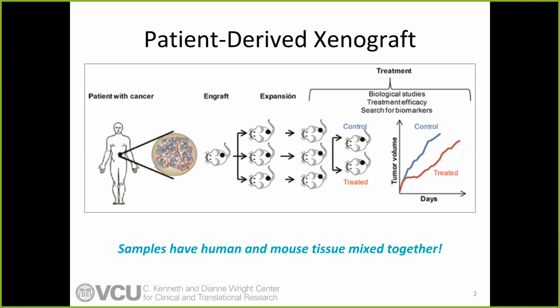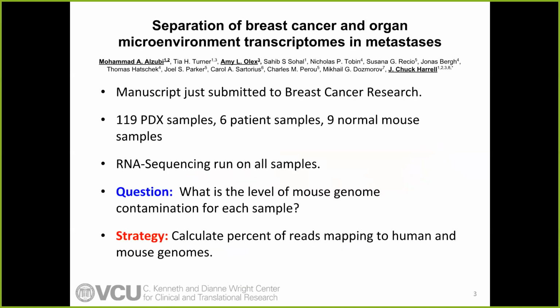However, this pipeline is focused on more of a quality control question. With PDX data, when you take a tumor that's been growing in a mouse, it's a human tumor, so that's human DNA, but you're inevitably going to get mouse contamination. You're going to get mouse cells in there. From my understanding, there are methods to try and separate those in the lab before you do sequencing, but they're not always perfect. There was a recent study, which I reference in the paper, that found that digital sorting through alignment does the best in separating out the mouse and human genomic content.